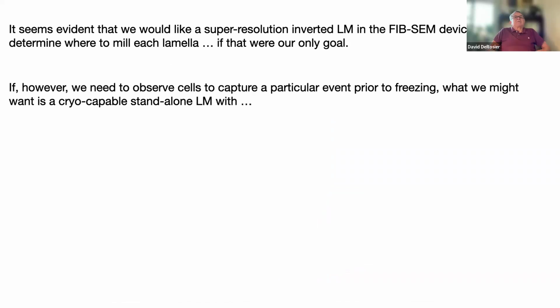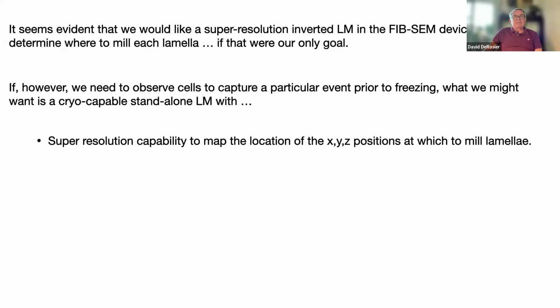Anyway, it seems evident that we would like to have a super resolution microscope, like an FPALM microscope, built into the FIB-SEM device, so we could determine where to mill each lamella if that were our only goal. If, however, we need to observe cells to capture a particular event prior to freezing, we may want a cryo-capable standalone fluorescent light microscope with super resolution capabilities, so we can map the XYZ positions at which to mill lamellae.